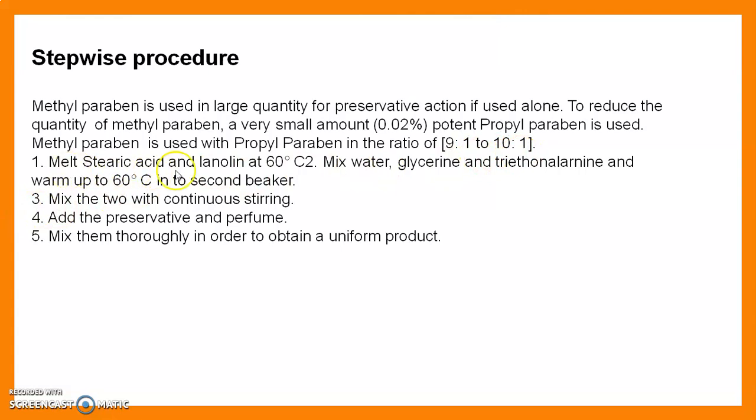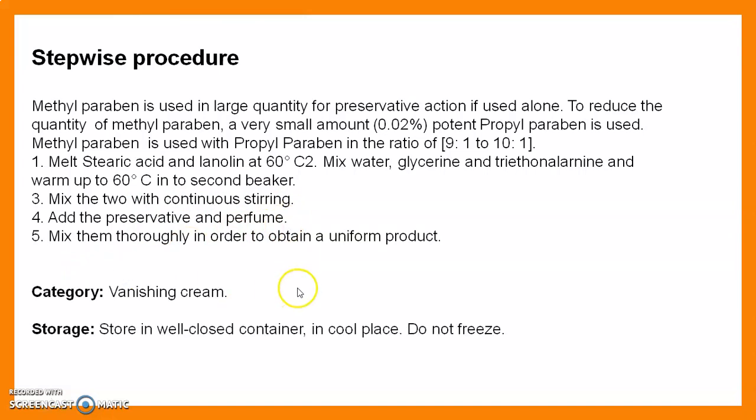First of all, melt the stearic acid and lanolin at 60 degrees Celsius. Mix the water, glycerin and triethanolamine and warm up to 60 degrees Celsius in the second beaker. In that second beaker, mix it with continuous stirring. Then add preservative and perfume and mix them thoroughly until a uniform product is obtained.